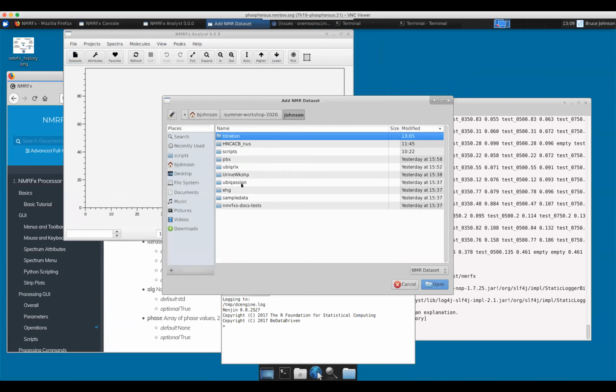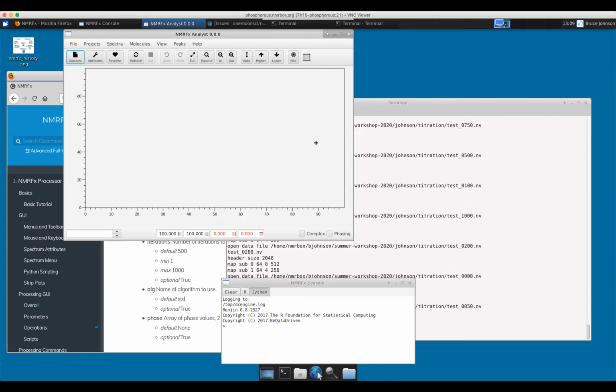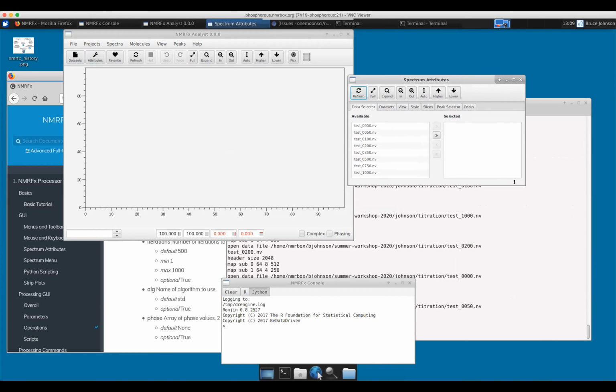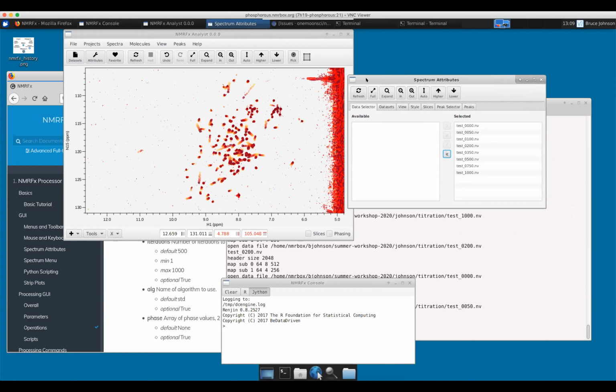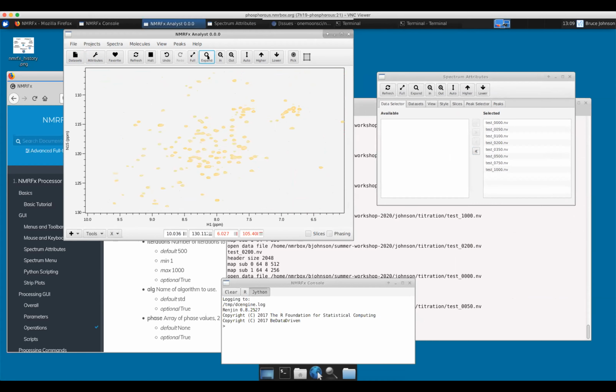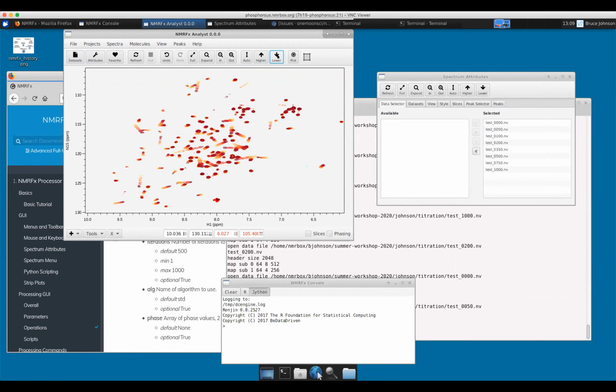And I hope it doesn't catch us in anything else. Like I say, one great reason to do these demos is because it forces me. We have quite a few tests these days, a lot of processing tests, but especially with these GUI things, it's not impossible, but it can get tricky to write a test that makes sure you didn't break something in it.